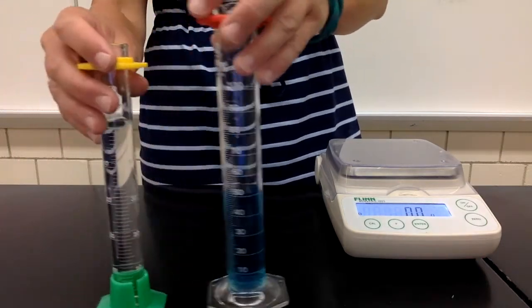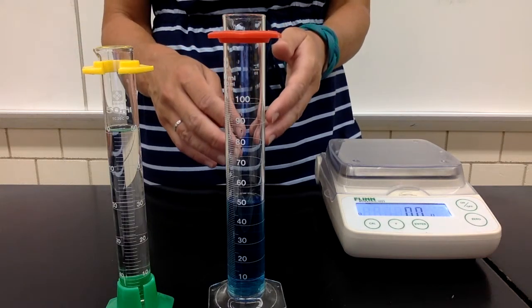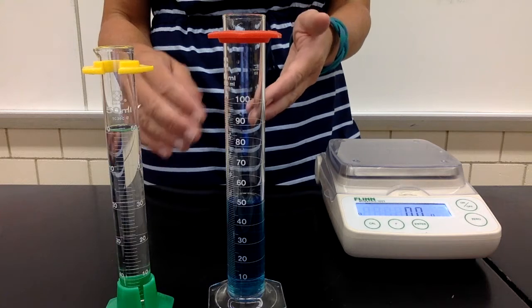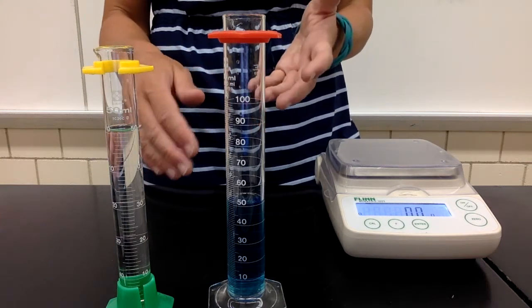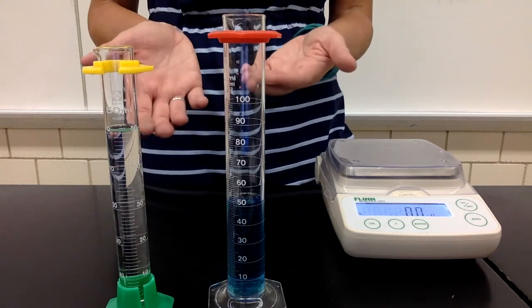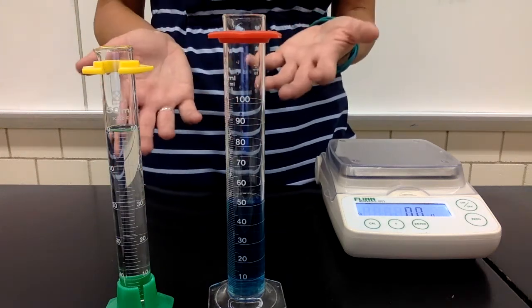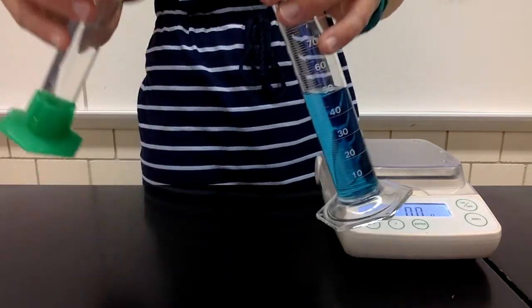I'm going to carefully pour the ethanol into the graduated cylinder containing the water, and I want the ethanol to form a layer on top of the water, and I don't really want them to mix until I'm ready for them to mix. So when I add 50 milliliters of ethanol to 50 milliliters of water, I should end up with 100 milliliters total of my mixture.